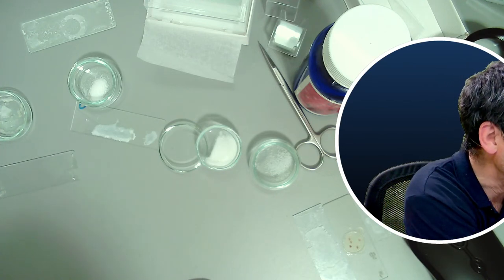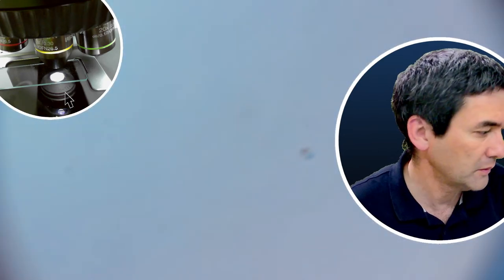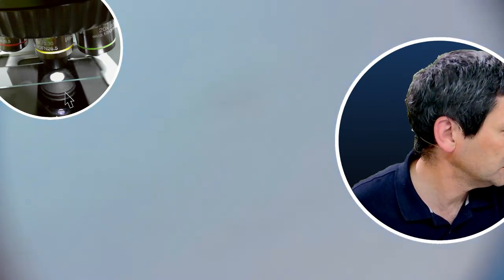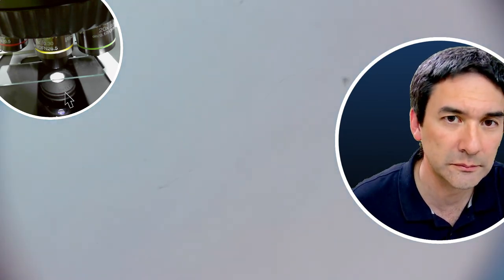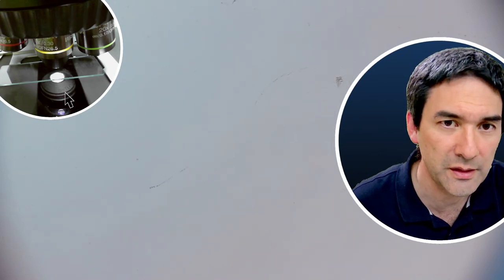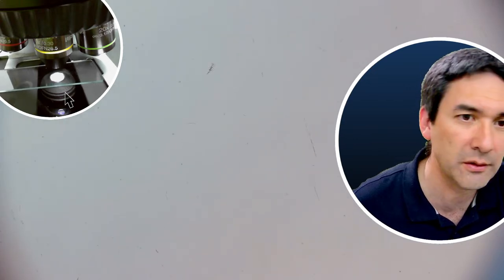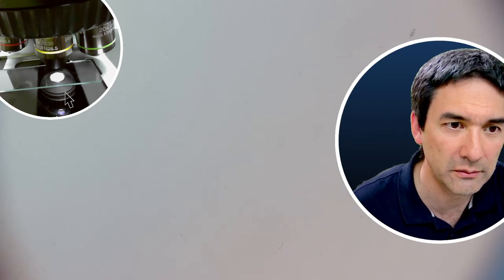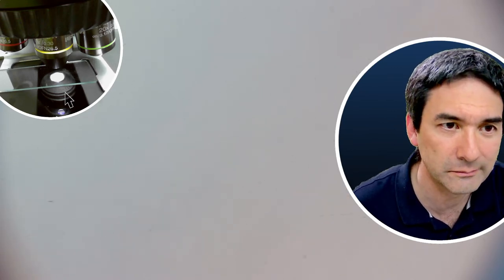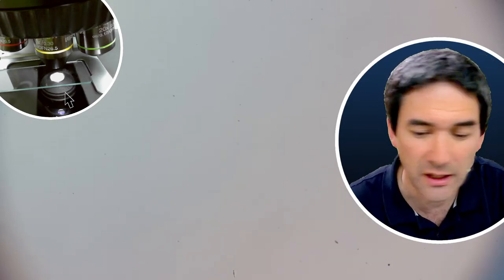Let me quickly check if there are some. I do have some house dust, which I also want to look at, and there are actually quite a few skin cells there. I don't see a lot here. I wonder if these things are skin cells. You need much more. I mean, there is a little bit of stuff here. Maybe some here. Not very interesting.